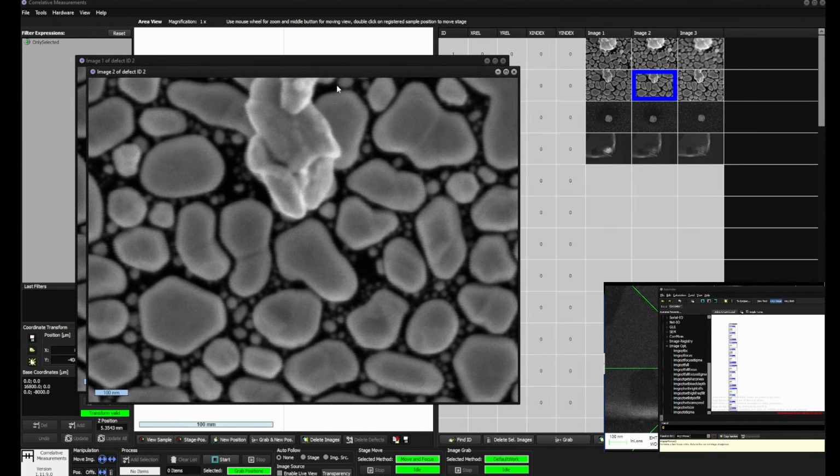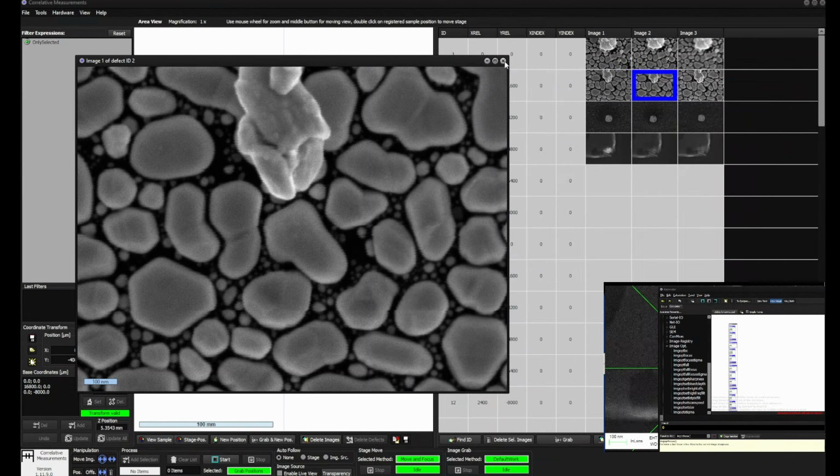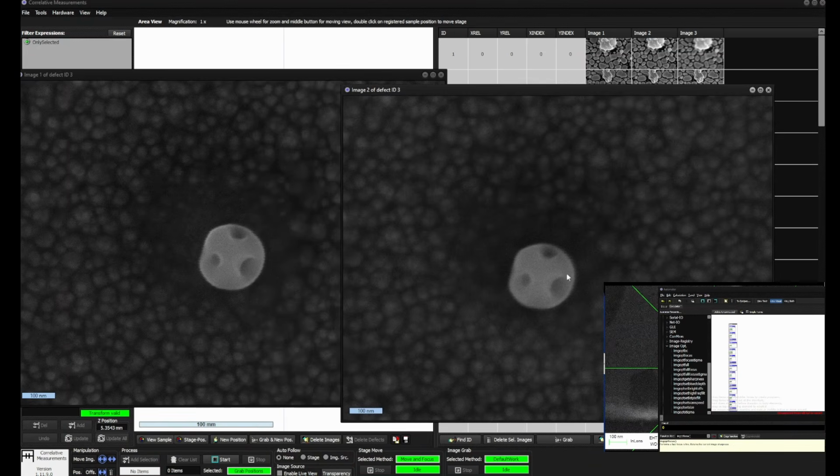On this one here as well, the new image has a little bit better corners than on this one. Then we have that image. Also here, this looks a little bit better.